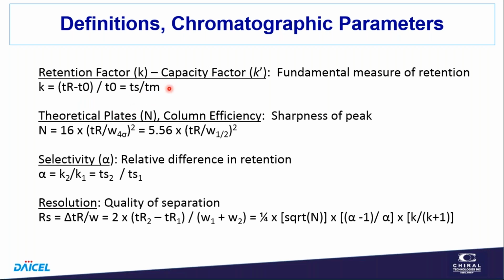You see it's dimensionless, that means it's unaffected by column length or flow rate, and so we can transfer this from one column length to another, or one flow rate to another. We'll know about retention factor.